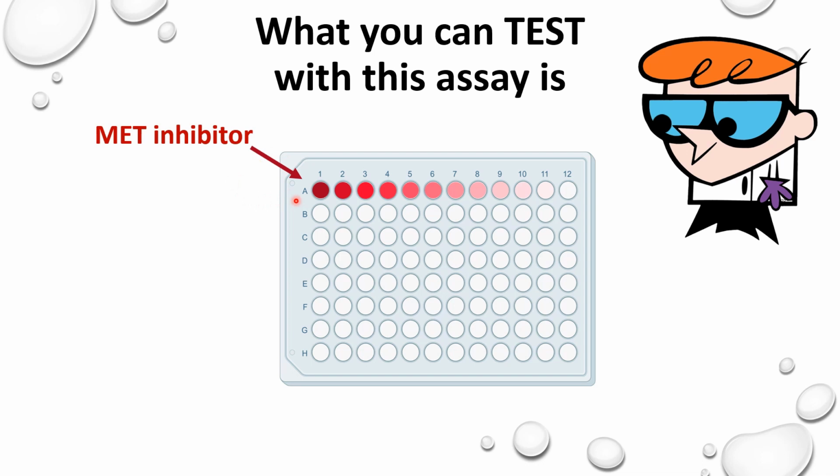And you want to see that even at a high concentration, the inhibitor is not killing your cells or affecting the cells in another way. You might sometimes also see that an inhibitor is actually activating cells at a high concentration, which immediately means that you're really dealing with a suboptimal molecule.